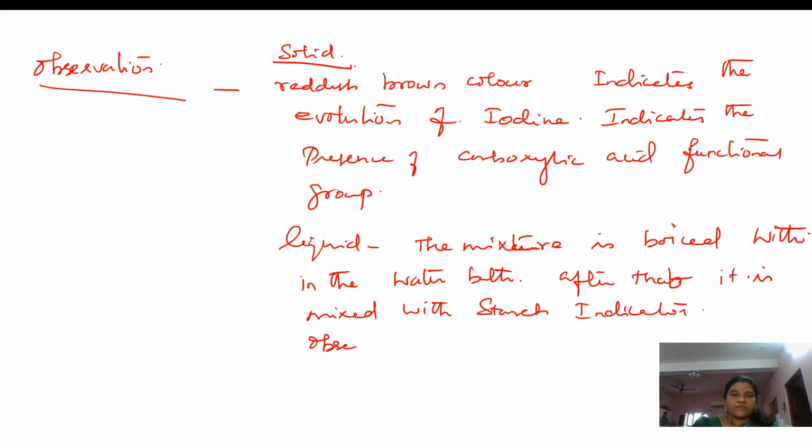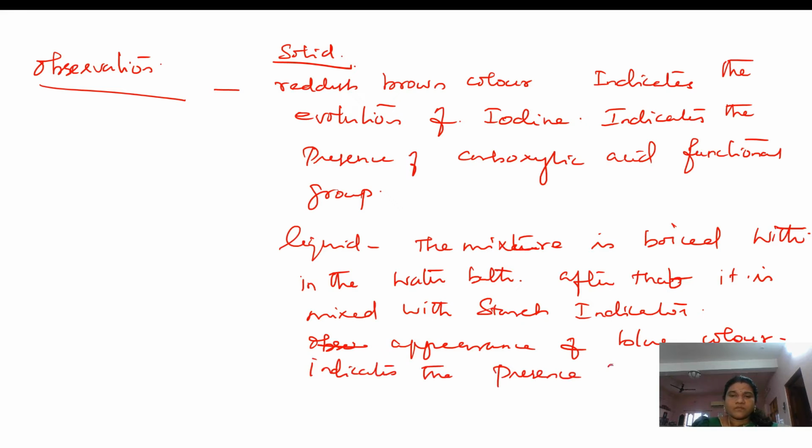The appearance of blue color indicates the presence of carboxylic acid.